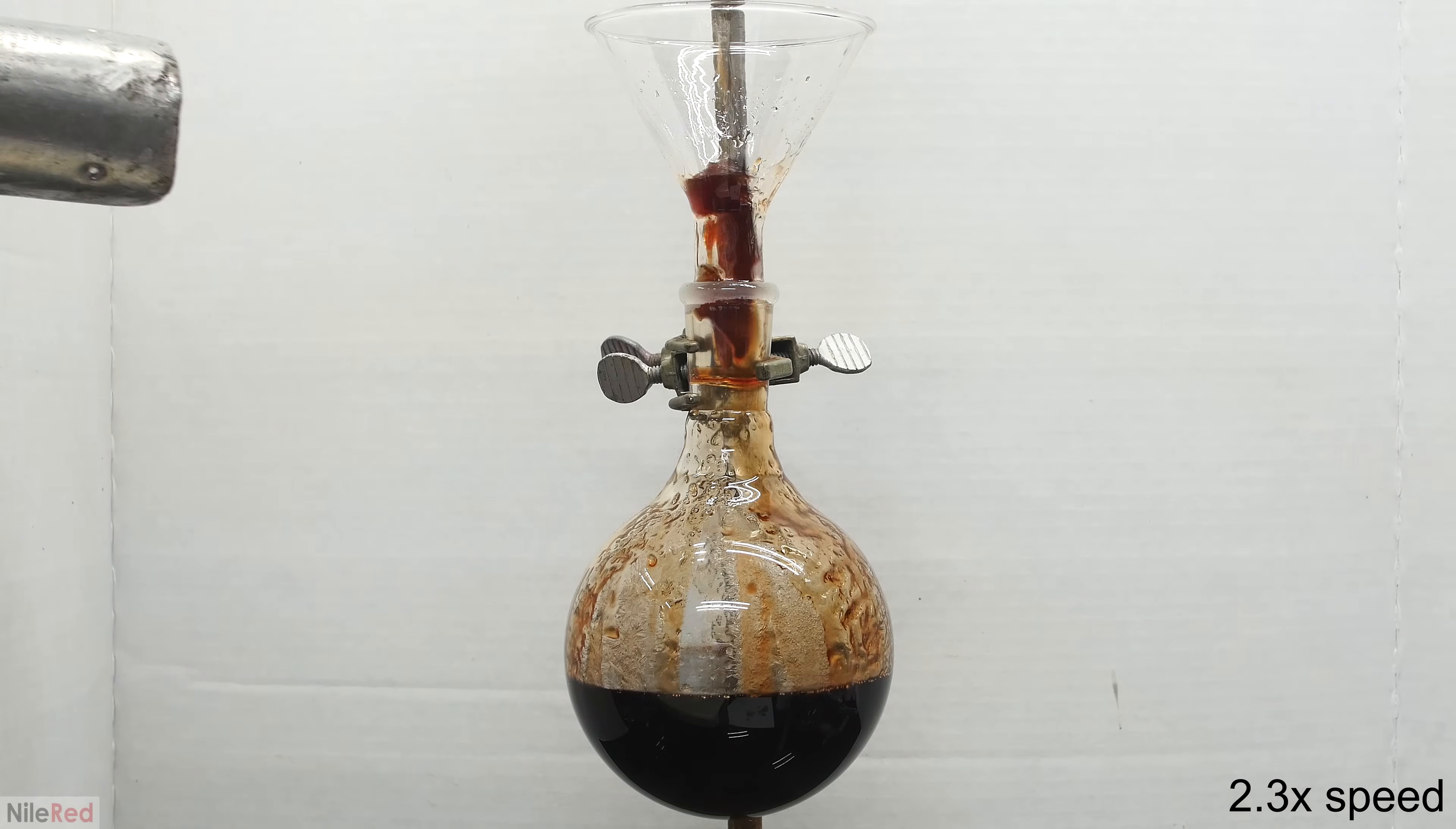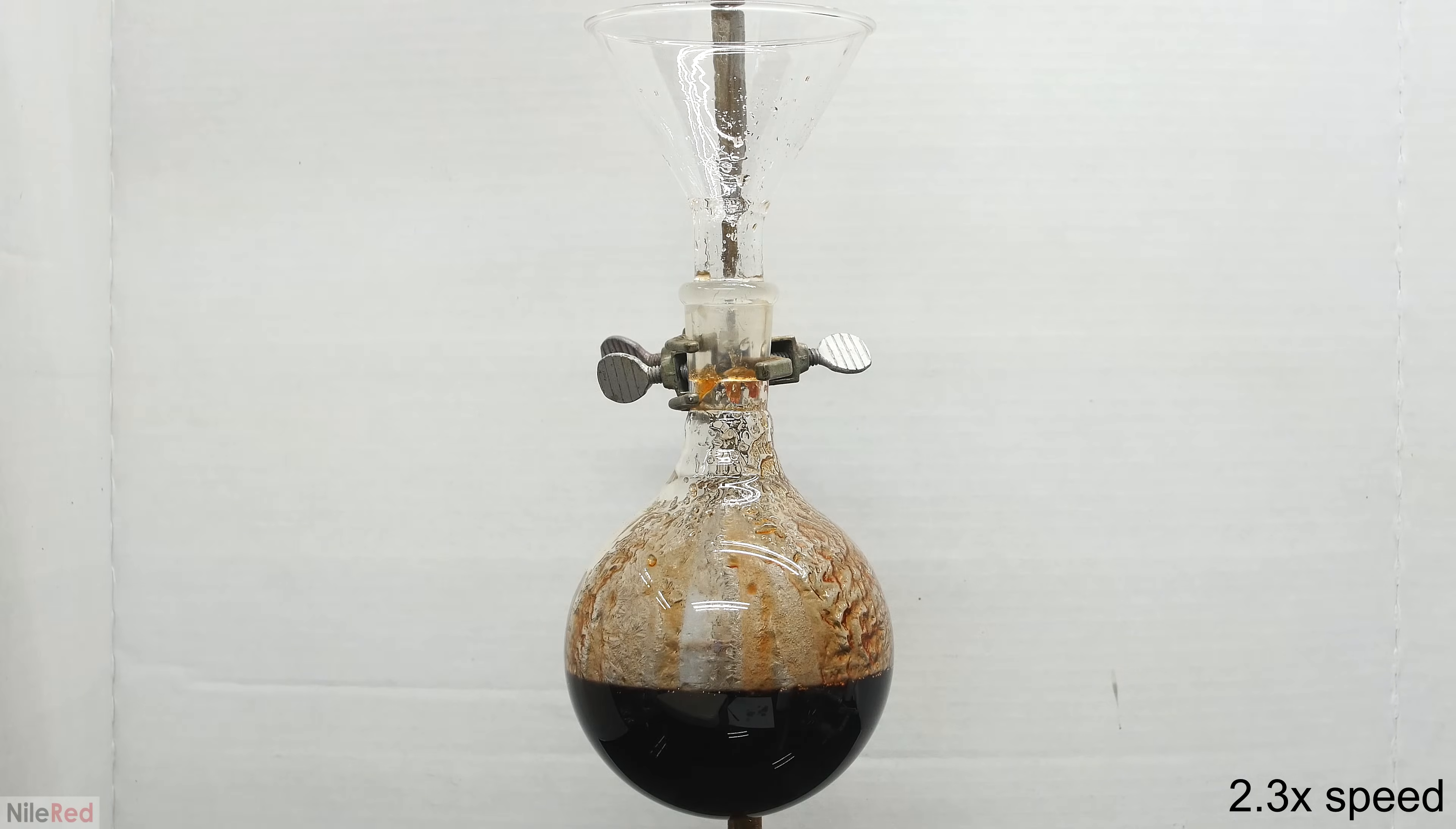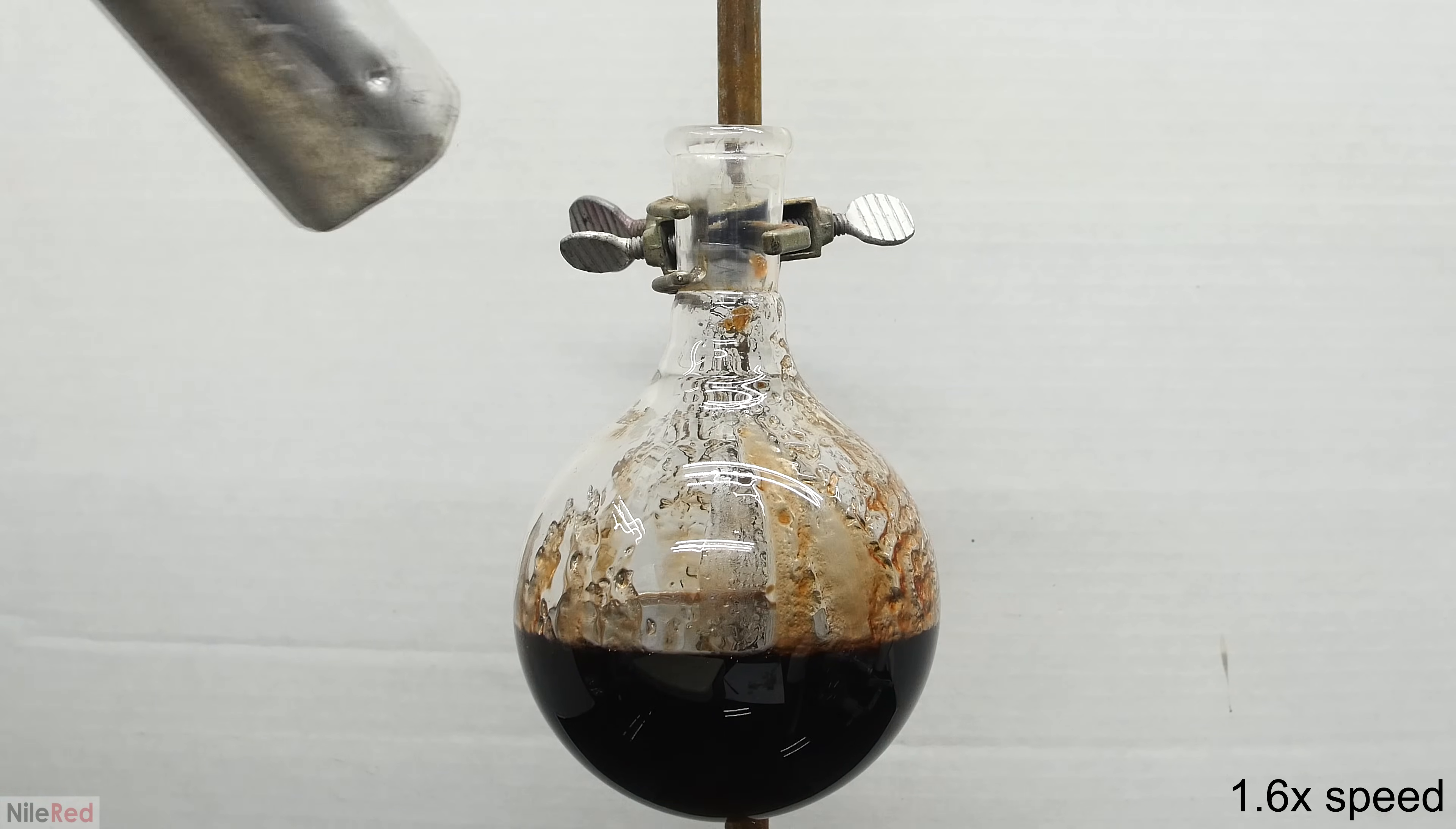Anyway, I was eventually done melting and adding everything, and I was left with a flask of super dirty black liquid phenol. I removed the funnel, and I melted the phenol on the side of the flask, just to try to clean things up a little bit.